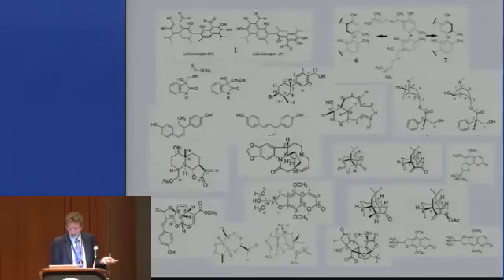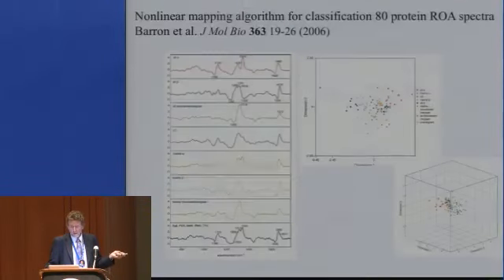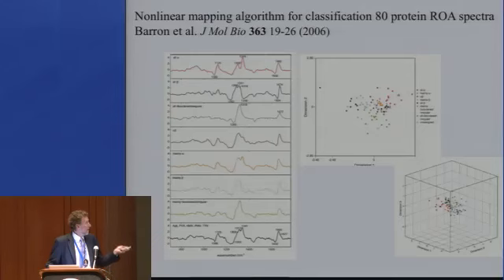But there are many, many natural products, and all of these have had their absolute configuration determined by VCD.